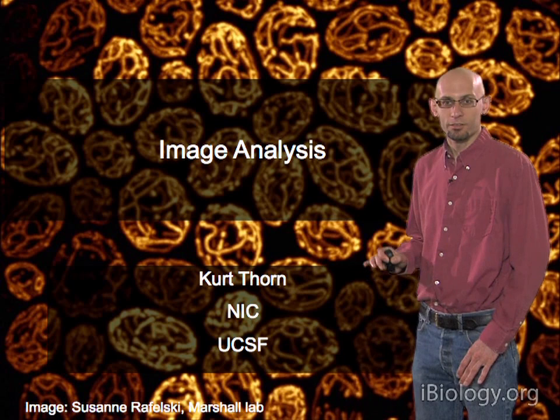We have our image here. It's now just 0s and 1s, and it's the image of this little funky-looking object here. The idea is we are going to apply the structuring element to this image and either take only pixels where the structuring element completely fits inside this object, or we're going to create new 1s in this image wherever there is a 1 that matches the center of the structuring element. So the idea in erosion is that at every 1 in this image, we put the center of the structuring element there. And if every 1 in the structuring element overlaps with a 1 in our binary image, then we keep that pixel as a 1. Otherwise, we set it to 0.